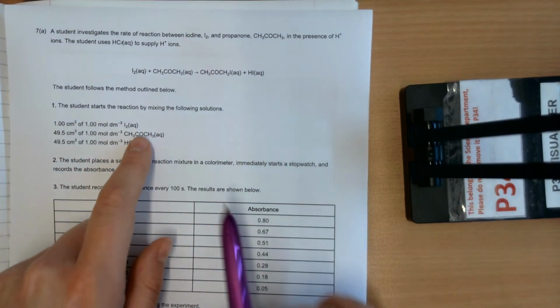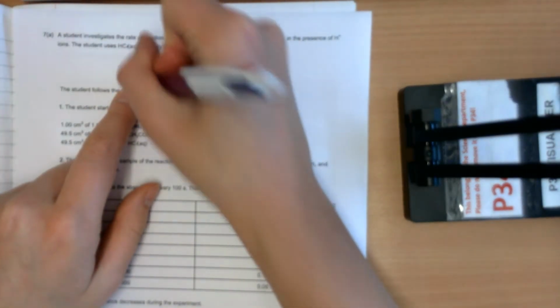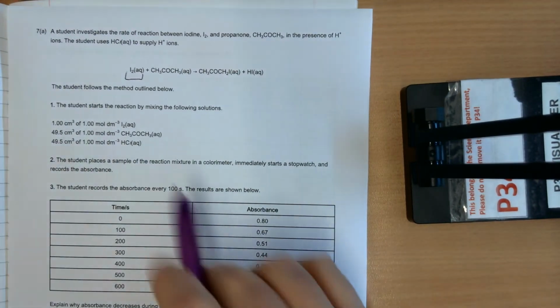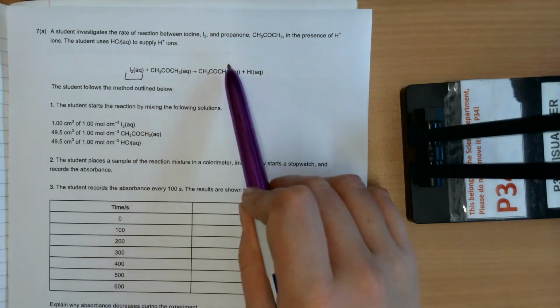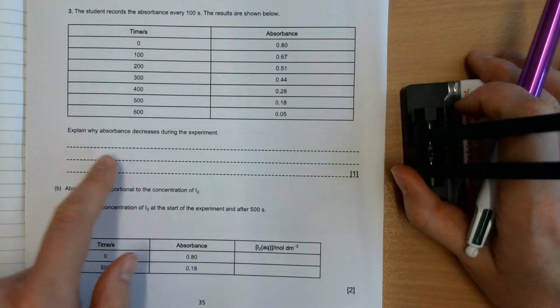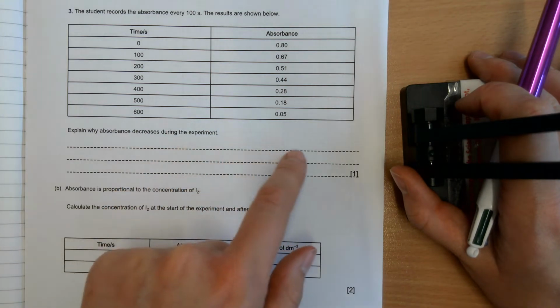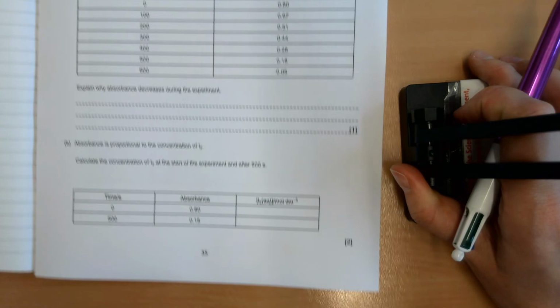First question is, why is the absorbance decreasing during the experiment? Okay, it's the iodine that is responsible for the absorbance of light. Because the concentration of iodine decreases as the reaction proceeds, the absorbance is going to decrease. So it decreases because the concentration of iodine decreases as the reaction progresses, and iodine is responsible for absorbing the light in the first place.